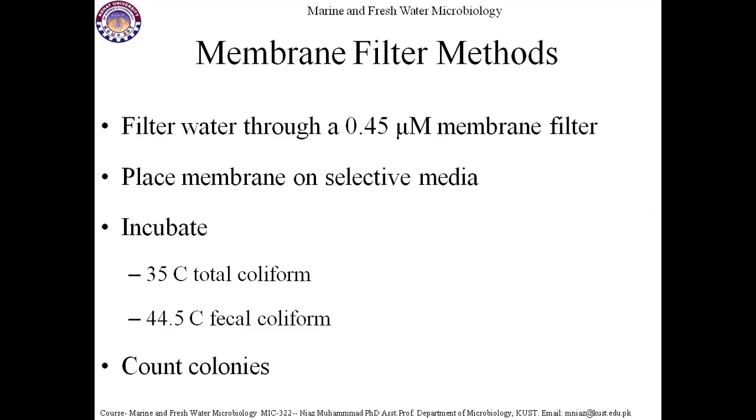So it is very easy, it is not difficult. We just have to take a filtration assembly. We have to keep the desired and required filter membrane in the assembly, through which we have to pass the required volume of water. Suppose if you want to check 100 ml, we have to pass 100 ml through that filter membrane. If we want to check 500 ml, we have to pass 500 ml of water through that membrane, and we have to collect that membrane and keep it on selective media.